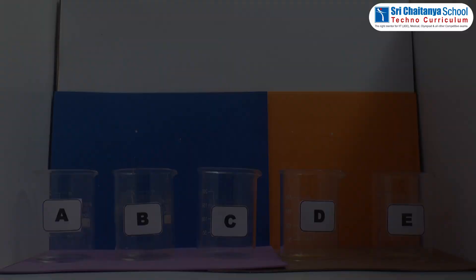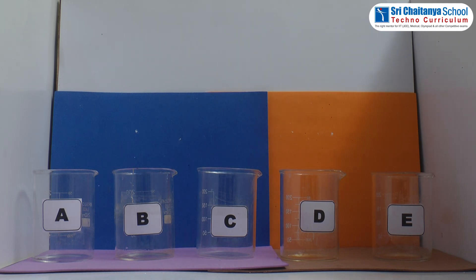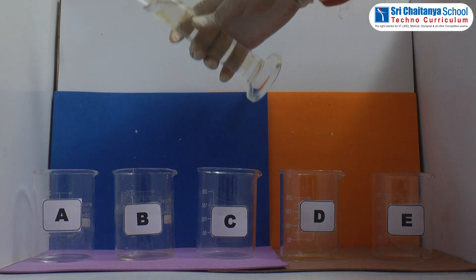Now it is time to see the procedure. Take five beakers and label them as A, B, C, D, and E. Fill each one of them up to half level with water.